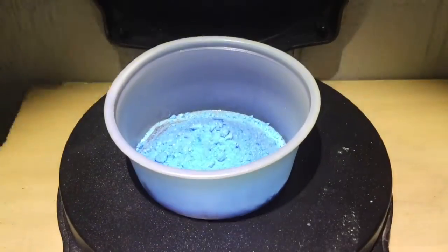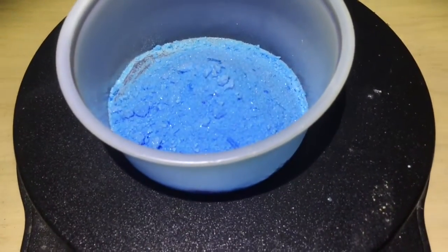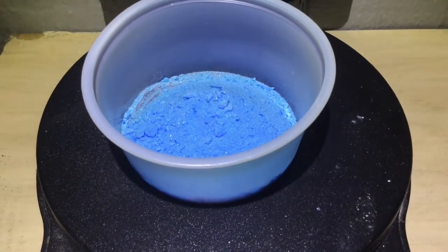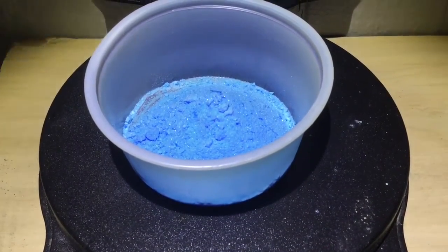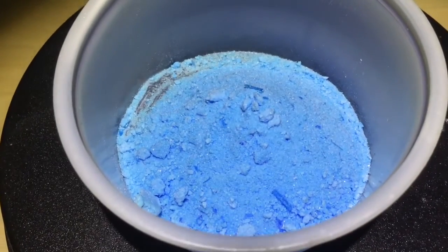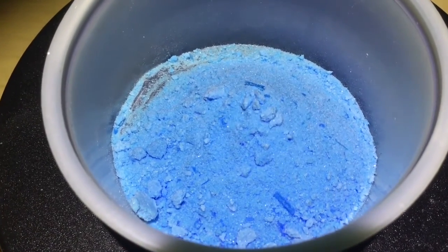Now that I've got my professional lighting out, you can see the copper sulfate pentahydrate's blue color. We're going to bake that water right out of it. Let me get a nice macro shot for you — three, two, one.